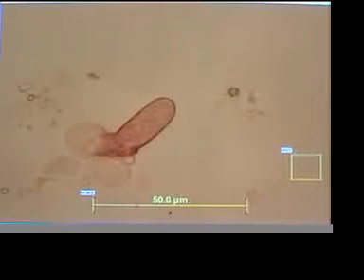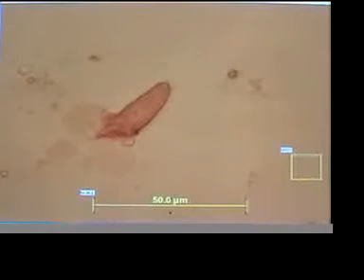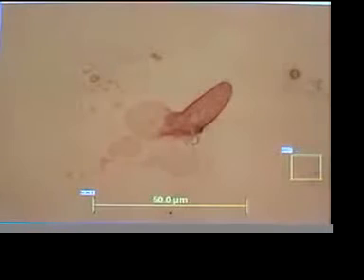It's also pretty slow. Maybe you can see things are happening down in the bottom. He's sort of devitalizing in two directions simultaneously. Let's watch him and see what we can see. I think I'm going to center him a little bit. Hang on. Okay, now he's more in the center of the slide. And then I can do this little effect, I'll cheat. Okay, watch the top. Here we go. Big changes here.